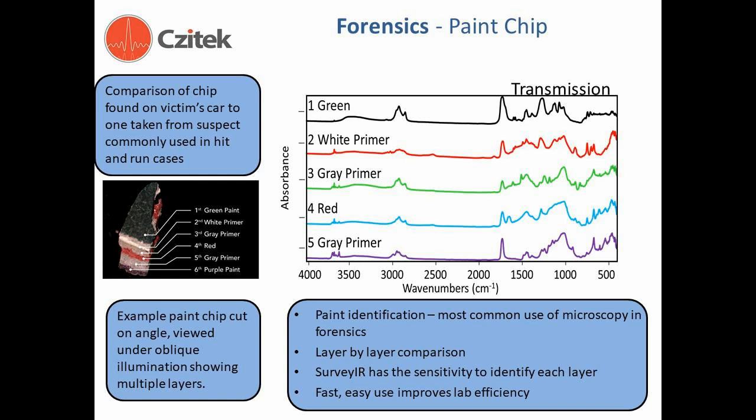Although each layer of paint consisted of more than one component, the infrared spectra exhibit distinct features consistent with the chemical stratification. By measuring multiple layers, more evidence and confidence in identifying the suspect can be obtained. This is another example pointing to the power of FTIR microspectroscopy in resolving complex samples observed microscopically and isolated using microspectroscopy optics.